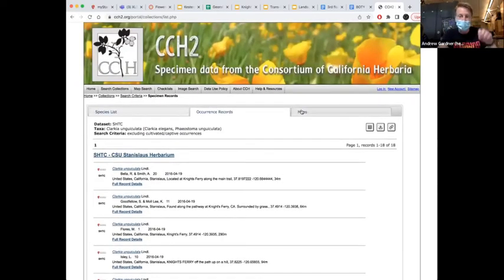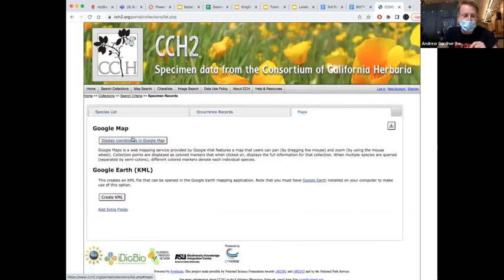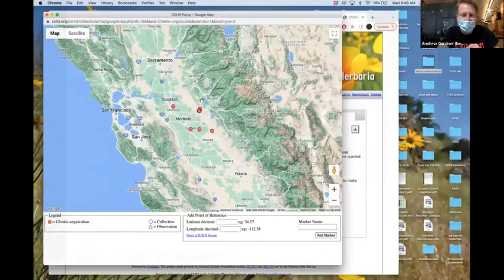One cool thing about our specimens is that because we put that location information in there, where they were collected, we can make maps. When I click on the maps button, I can see where all of our elegant Clarkia specimens have been collected from. So here's the map of our specimens that are in our herbarium. You can see that we've collected it from areas in the Central Valley and also in the foothills. So this is like Mariposa up here. This is like Knight's Ferry. And here's Turlock, where we are.